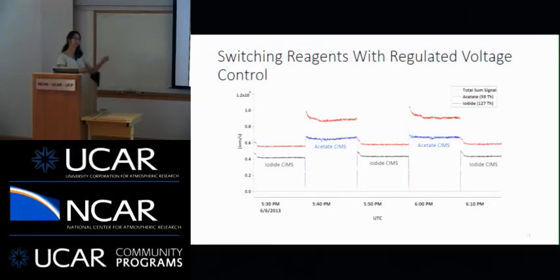We switch and we measure with acetate ionization back to iodide. It turns out, for the instrumentalists in the room, there are some tens of seconds now. We've pulled this down, but we do have a changeover time, and that is entirely due to pressure differential, because it turns out no matter how you attempt to control your pressures, in the ion molecule reaction region, where we're looking at a few hundred millibar, tiny fluctuations really change your chemistry, and it takes a few moments for the pressure to normalize.